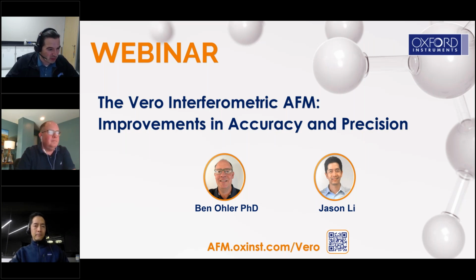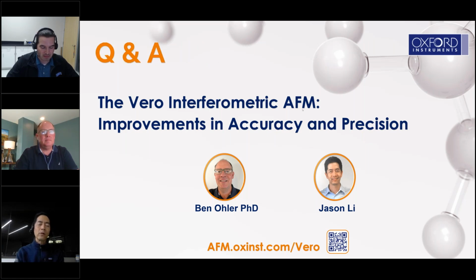To start, I have a question addressed to Jason: is it possible to make lateral PFM measurements on Vero? Yes, absolutely. We didn't really mention this in the talks, but we have both detector types present in the Vero AFM, so you can choose which type you want to use. We recommend, of course, QPDI for its increased accuracy and precision. But if you wanted to do OBD just like you've always done, that's also an option. So yes, you can do lateral measurements with OBD.